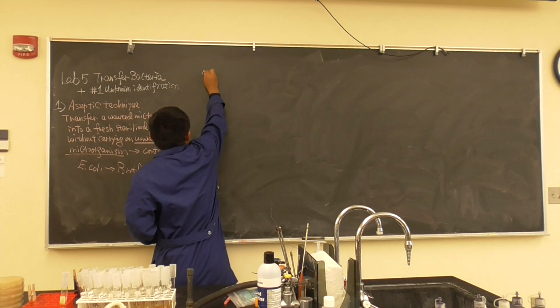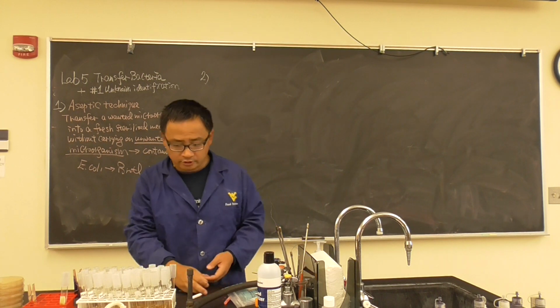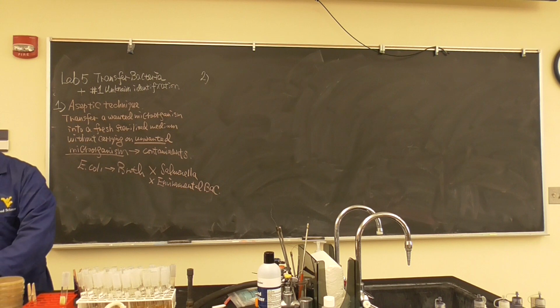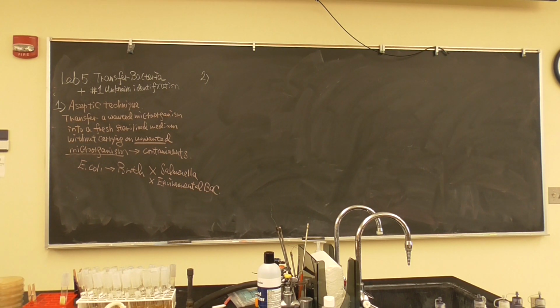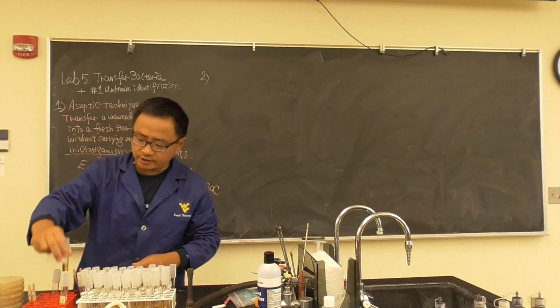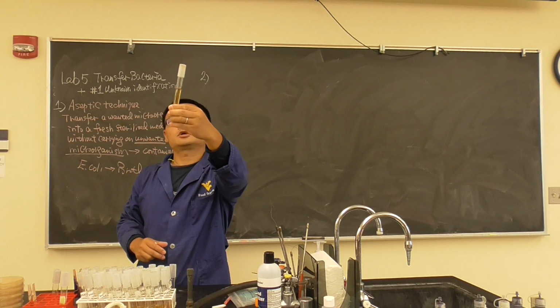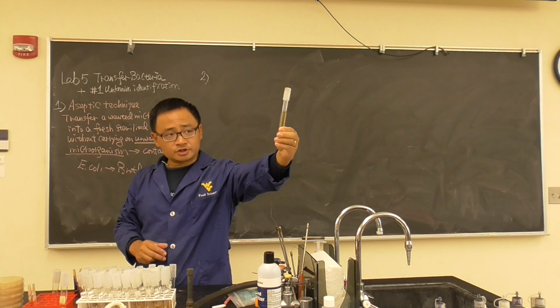The second thing, we would love to introduce you to several of the bacterial media, what they look like. We will talk about the details in the lecture section today. Number one, you will see right here, is a very simple liquid, looks like a little bit yellowish, brownish color.